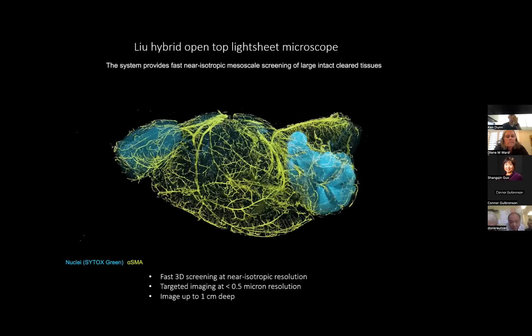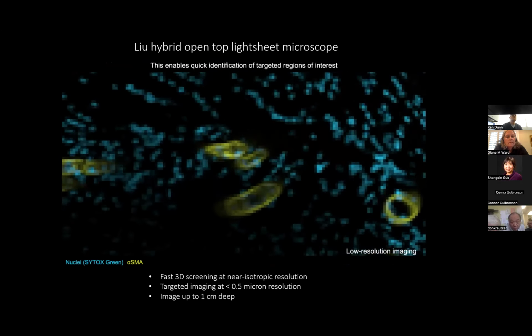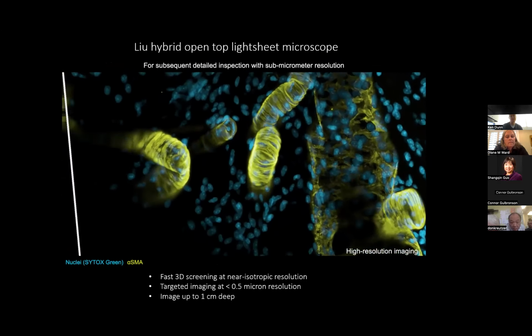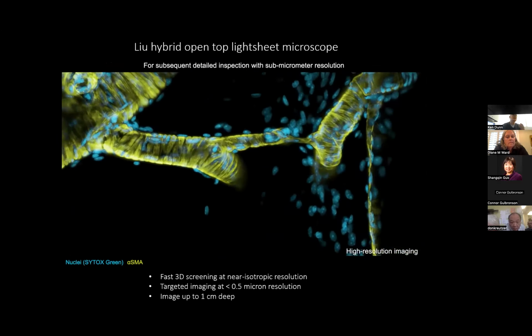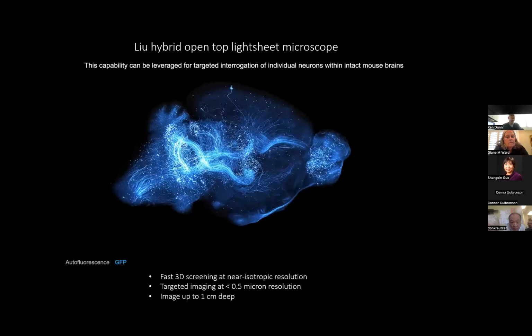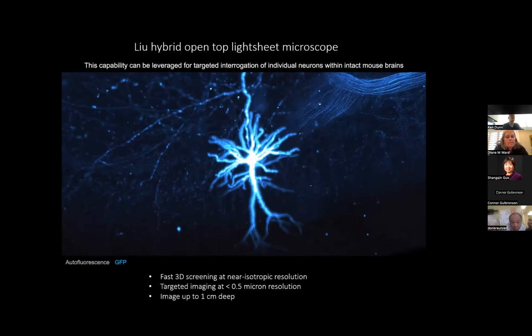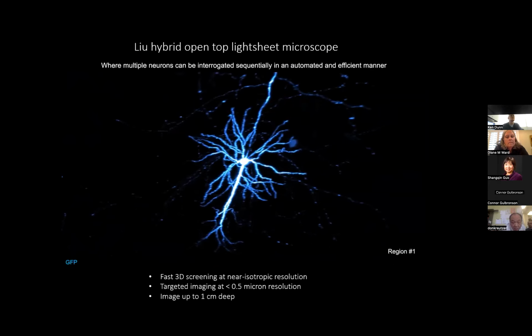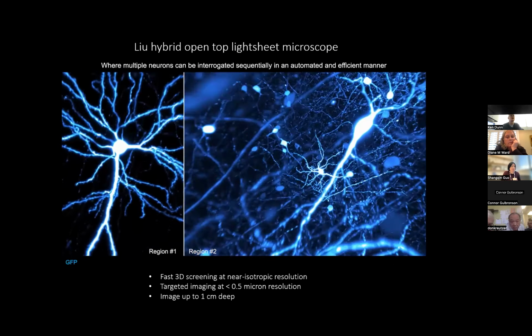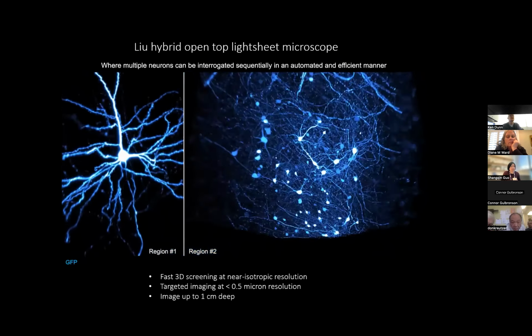All right. So again, this is a volume I showed you a moment ago. This is the image before with one light path versus the other light path. So the idea, and I think this is fair, and the example that they show is a good example. You don't necessarily need to image an entire organ at subcellular resolution, but you would like the opportunity to inspect certain areas. So here's an example of going in and looking at individual neurons, for example.